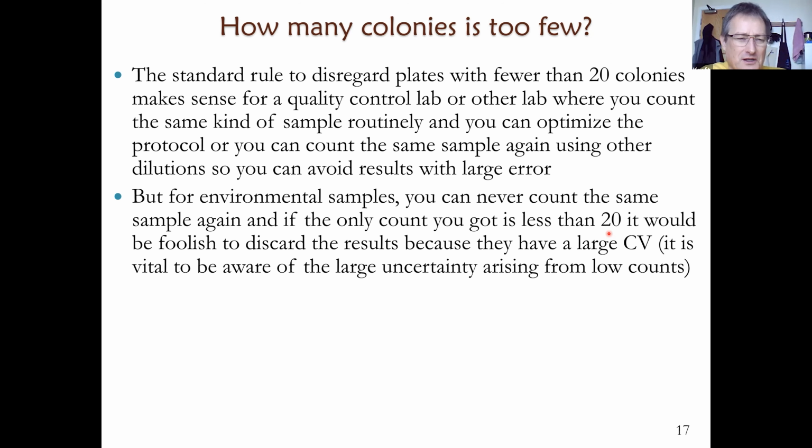But now you can calculate the standard deviation of this from the Poisson distribution as the square root of the total count, which gives 20 or thereabouts. And you can then calculate the standard deviation in CFU per milliliter by dividing that standard deviation by the volume that you've counted, same as above. So you get 929 CFU per milliliter.